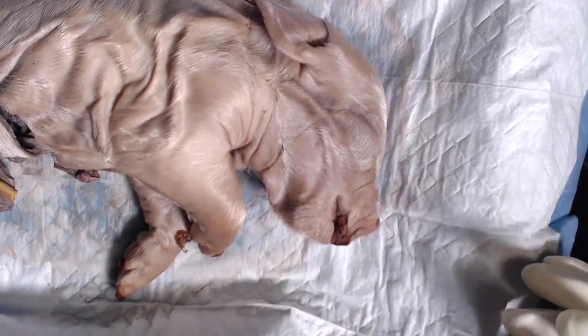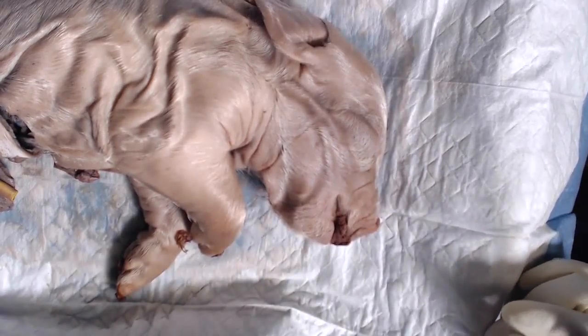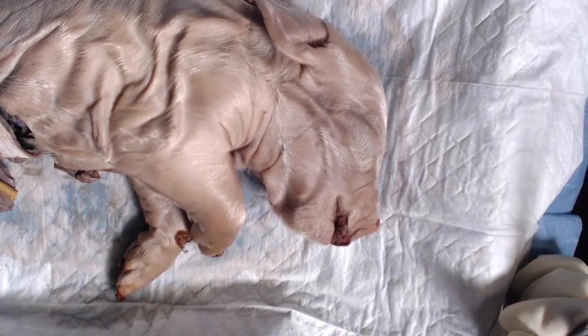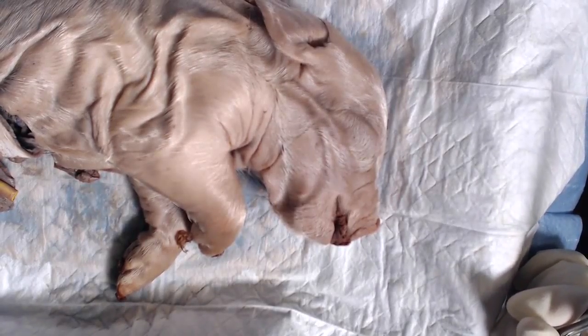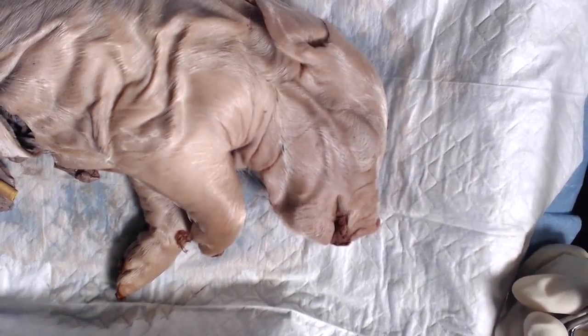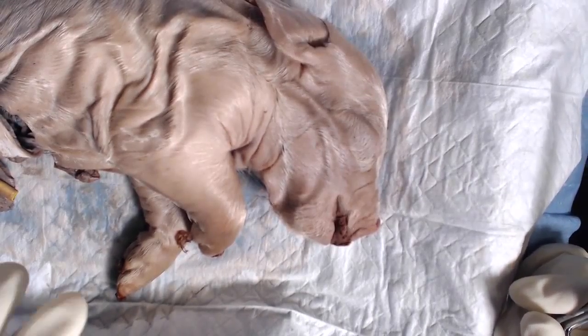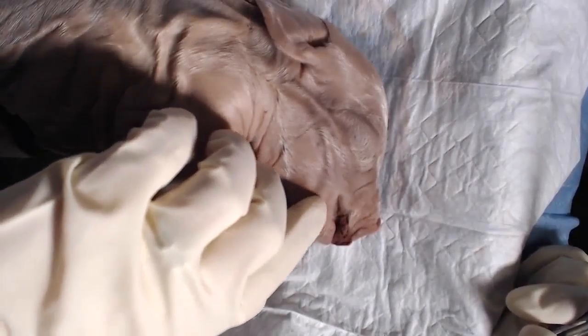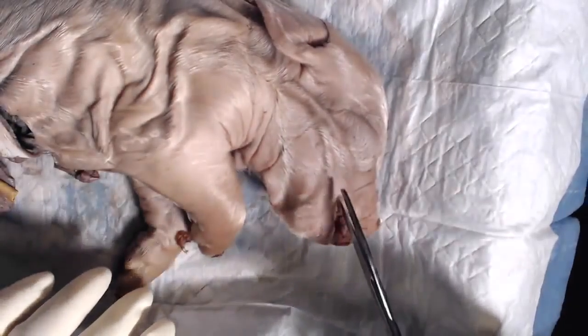I just wanted to point that out because pretty shortly we're going to be cutting the skin away from that muscle. As you're pulling the skin away from it, you want to try to not cut that muscle or any of the structures around it, because that's what we're going to be looking at. So once you find your masseter, then turn your attention to the corner of the pig's mouth, right here.